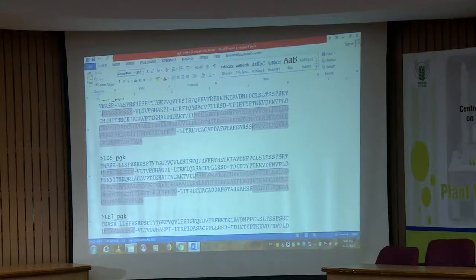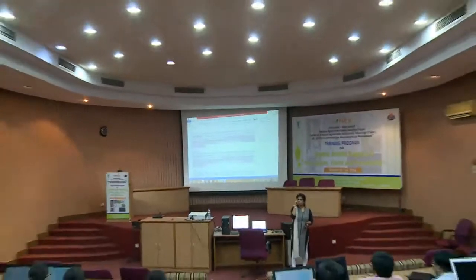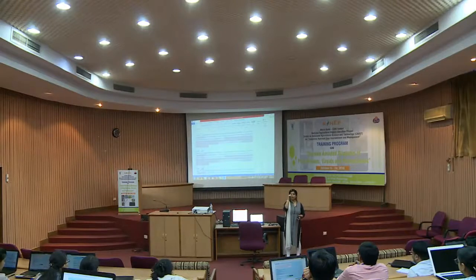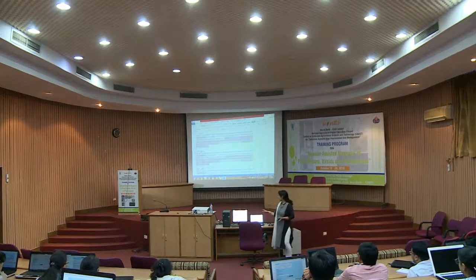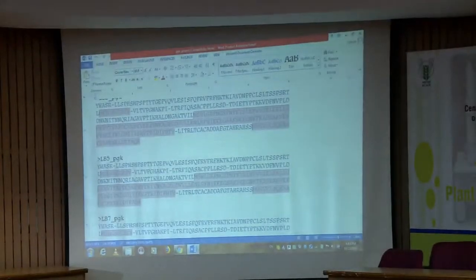If you will see some sequence in NCBI, I think I can just show you how it looks like. If you will just see in the coordinates and the complements, it will show you some figures from like 1 to 10, then again that greater than equal to sign, then again I will just show you how it looks. So, this protein file also should be ready before that flat file preparation.